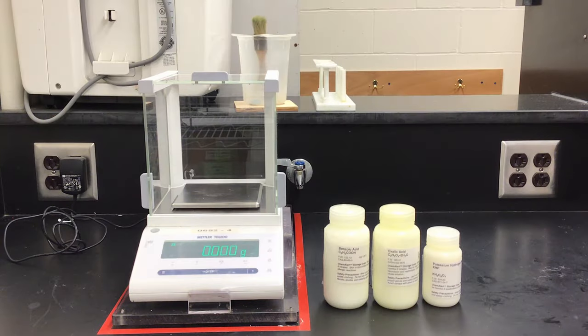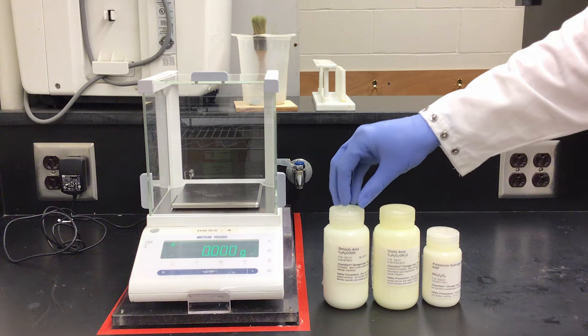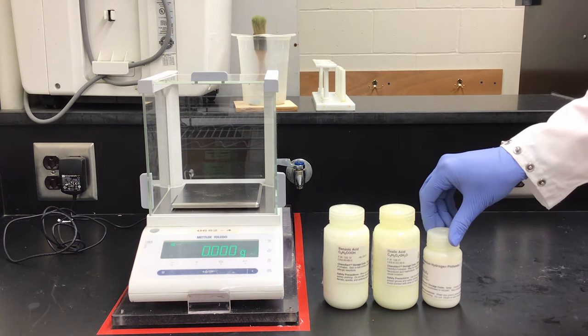Today we are doing part one of acid-base titrations: the standardization of sodium hydroxide. To do this we have three pure solid acids — benzoic acid, oxalic acid, and potassium hydrogen phthalate.